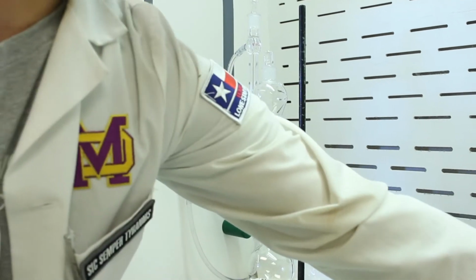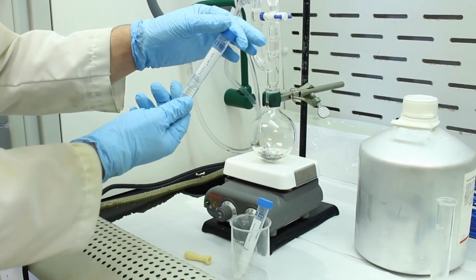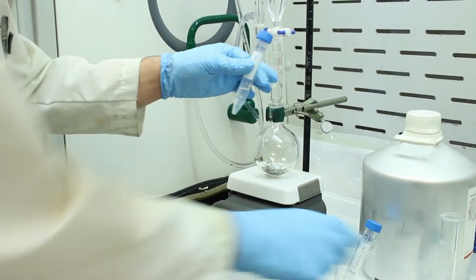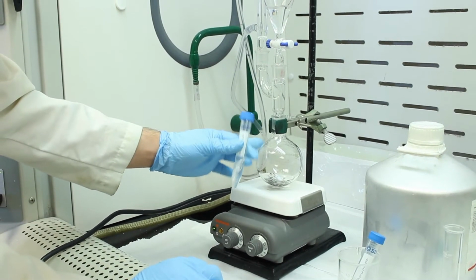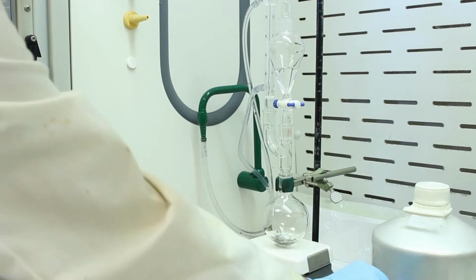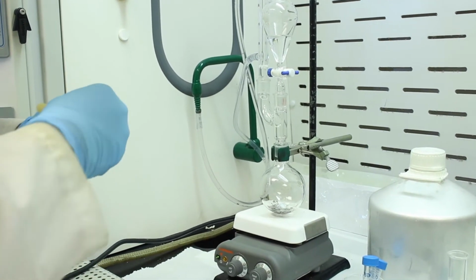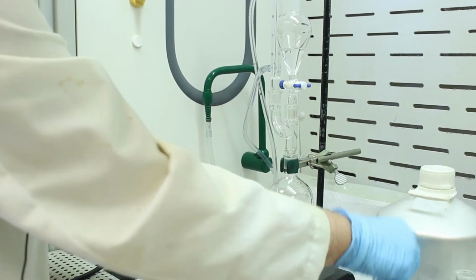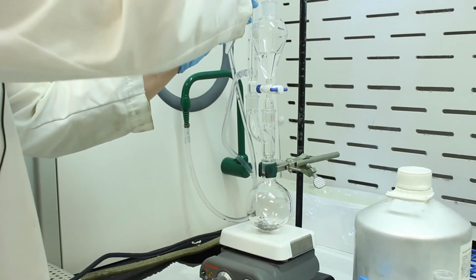Okay, now we're going to add our halide. So here's our bromobenzene. Okay, it's about 3.5 mils. We're going to add about half of it to the flask here and about half of it to our sep funnel. Okay, so I'll grab a pipette. And you can sort of eyeball this. So I'm going to add about half to this sep funnel here.